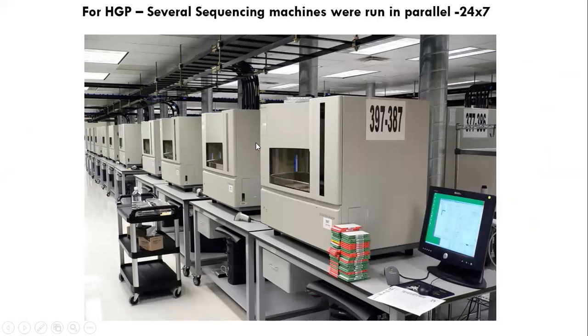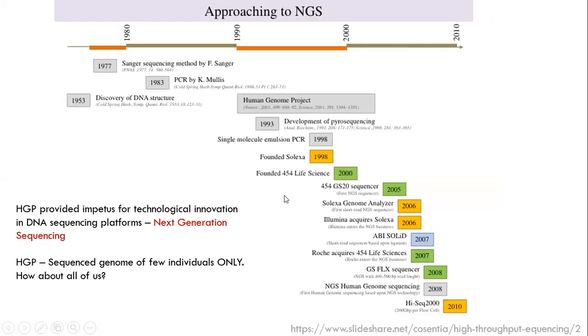They made factories of DNA machines doing automated Sanger sequencing, so that multiple parallel copies of the DNA can be sequenced. And you see the well plates here. You may have a code for the machine, a code for the plate, and automate the data. So it is simply a warehouse. A lot of money was invested to reduce the time and effort. Parallel machines ran 24/7, and at the end, we were able to sequence the human genome.